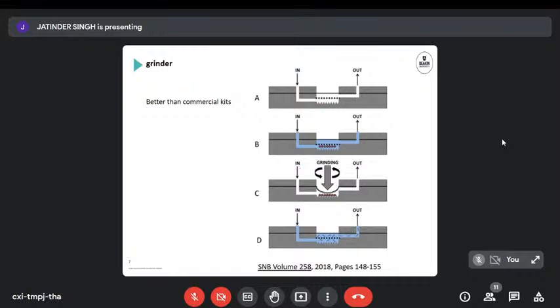So if the cells are being pumped into the microfluidic channel, we can push them and move them around by putting pressure on the flexible membrane here. We force the cell onto the sharp dots by alternating the pressure. You move them around, you wiggle them around, they pop open, they release their contents.